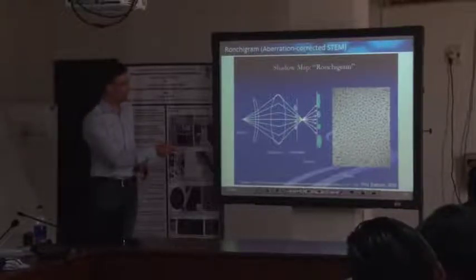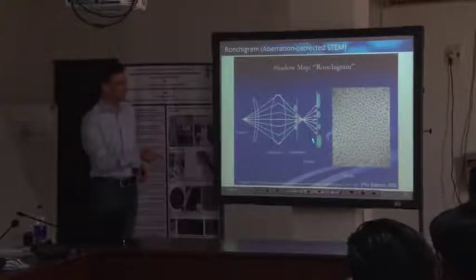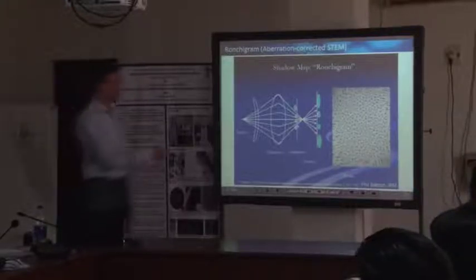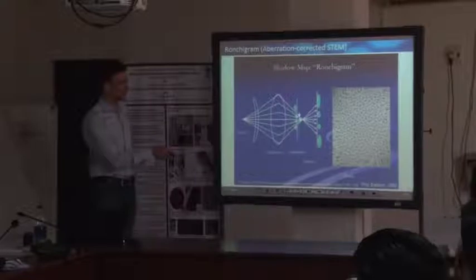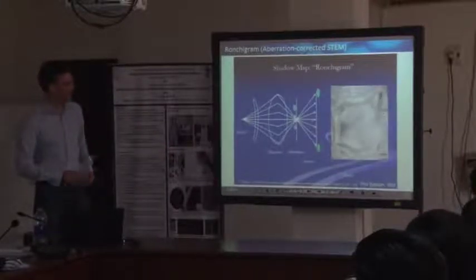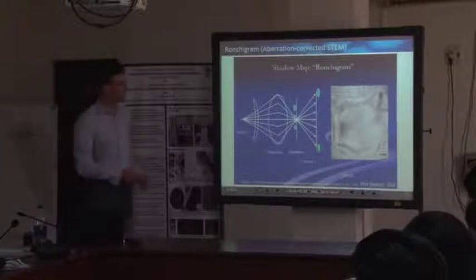What happens if you focus this electron probe now? In this particular case, you see a very nice shadow image with a large field of view with this aberration corrected probe. This can be simply understood because CS doesn't affect our shadow image that strongly anymore.